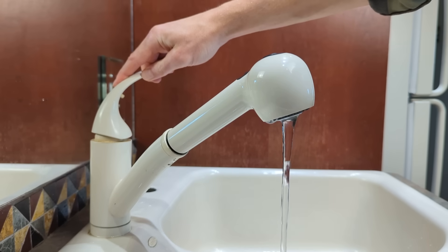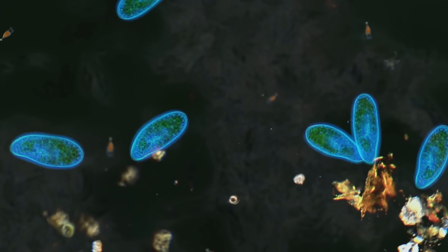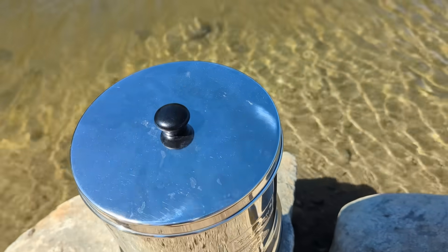For the city water test, we used both the black Berkey elements and the PF2 fluoride filters. For the untreated pond water test, we really wanted to check the claims that Berkey filters can remove bacteria, so we removed the fluoride filters for this one and only used the black Berkey elements.